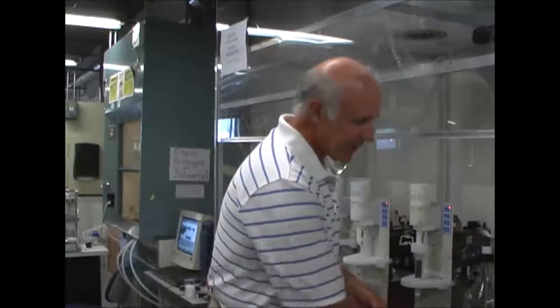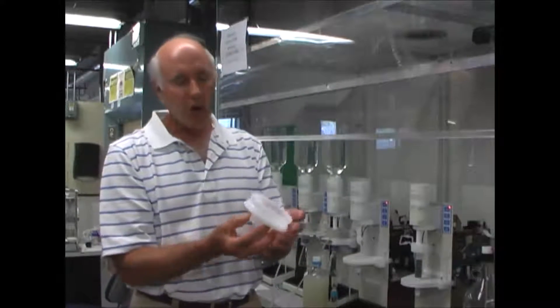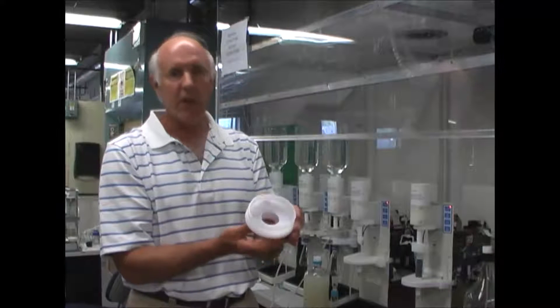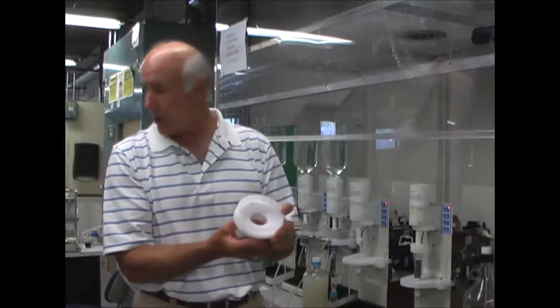And what we've done is actually designed a custom holder whereby I can use a small 47 millimeter disc in the bottom and put a 90 or 100 millimeter pre-filter on the top.